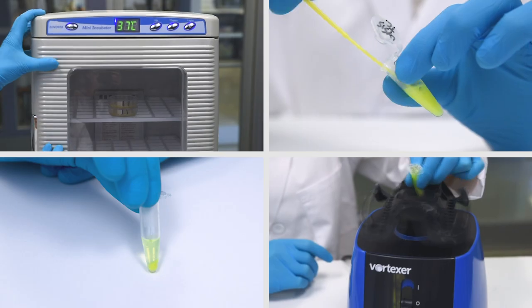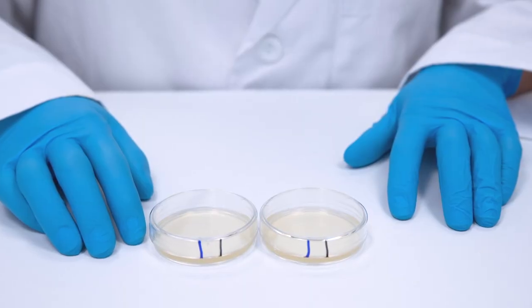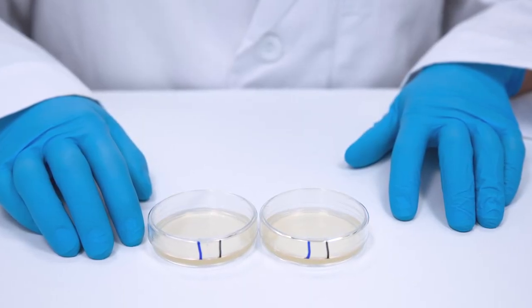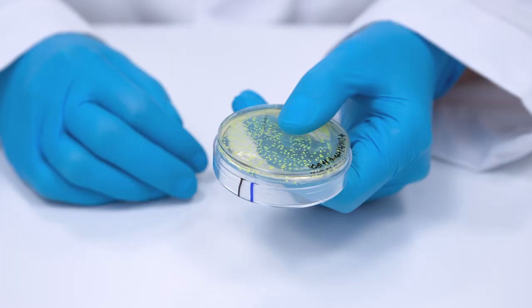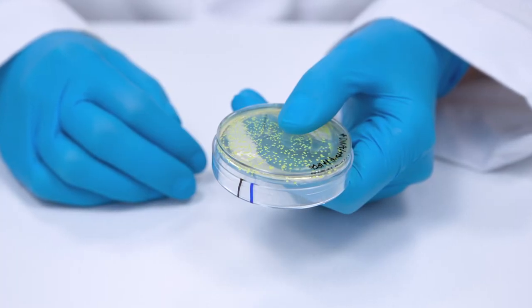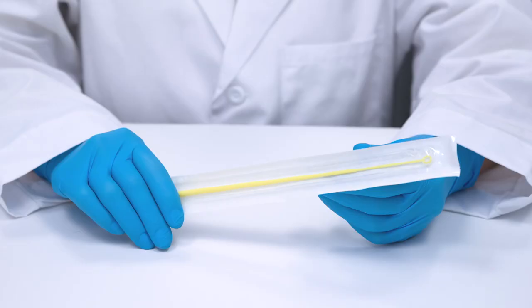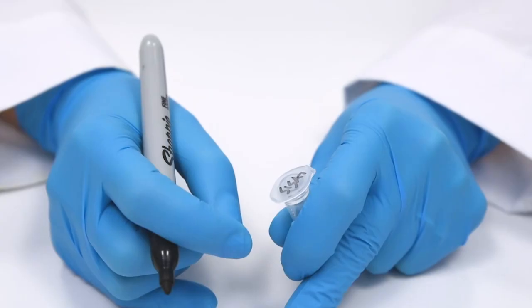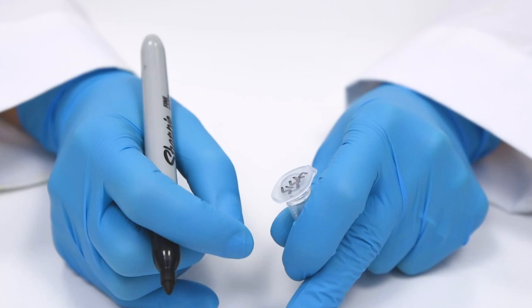For this module, you will need 2 LB agar plates containing ampicillin and IPTG, transformed bacteria from Module 1, or a plate of control pre-transformed bacteria, sterile inoculating loops, and finally a microcentrifuge tube containing lysis buffer.